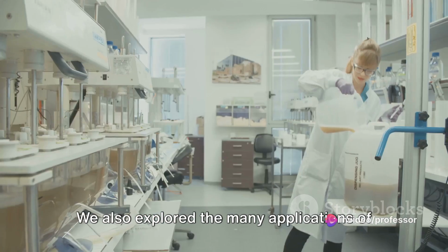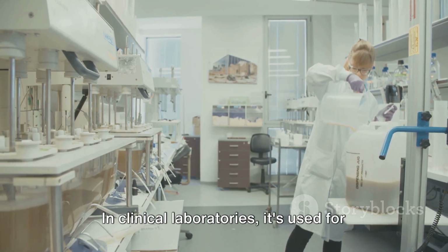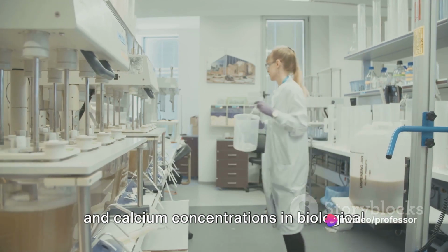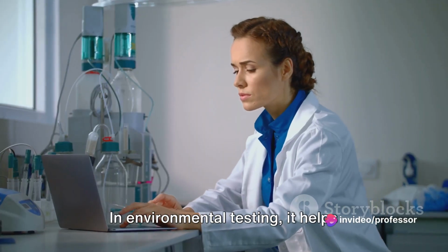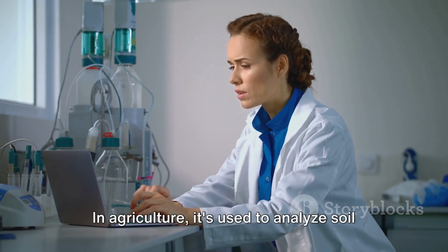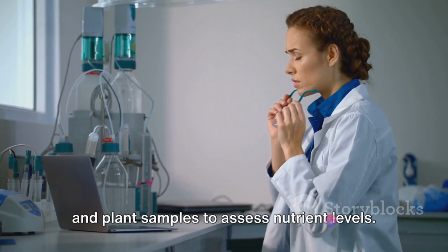We also explored the many applications of flame photometry. In clinical laboratories, it's used for the determination of sodium, potassium, and calcium concentrations in biological samples, which is vital for diagnosing various health conditions. In environmental testing, it helps determine the presence of pollutants. In agriculture, it's used to analyze soil and plant samples to assess nutrient levels.